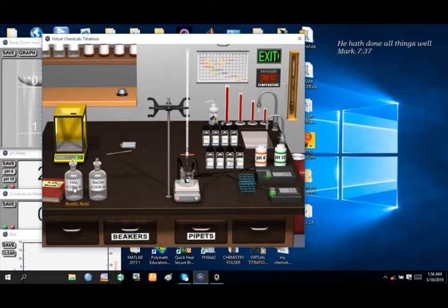So in this titration, we look at a situation where the titrant, which is in the burette, is titrated against the analyte until it is completely consumed.